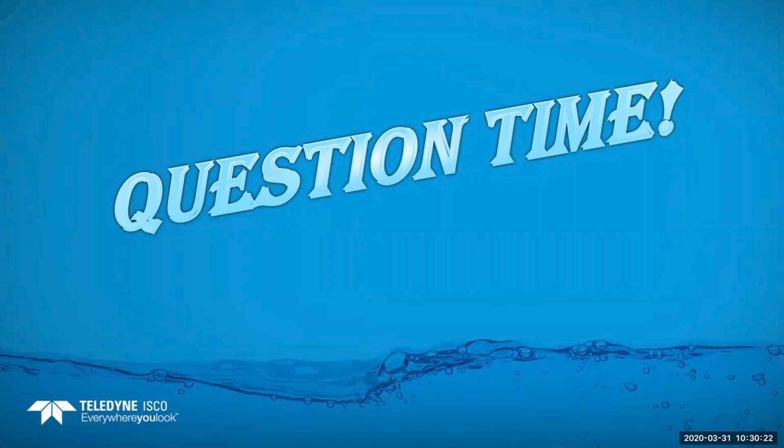You can set those down to 1 or 0, so it doesn't ever do the purges for you, and it just does the pump routine. It skips the pre-purge and the post-purge. Those are definitely model and manufacturer dependent. If you need to do that, make sure to ask that question before you actually get your sampler. But yes, you can do that on some models.